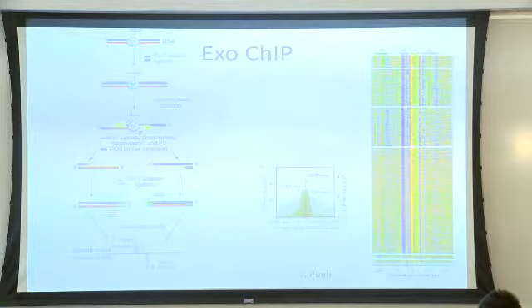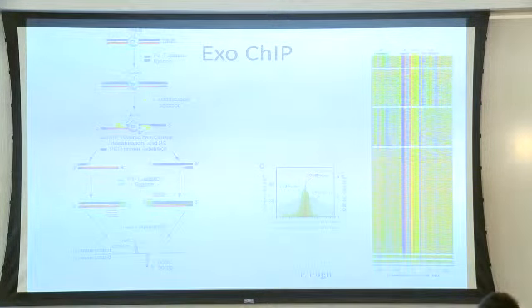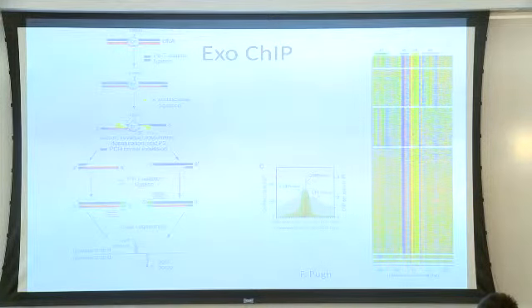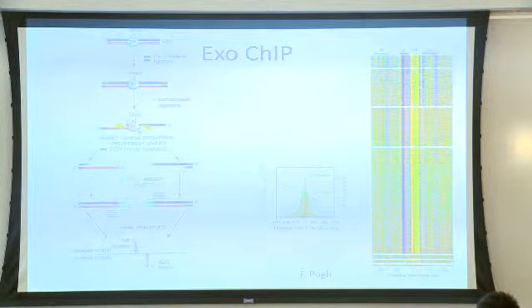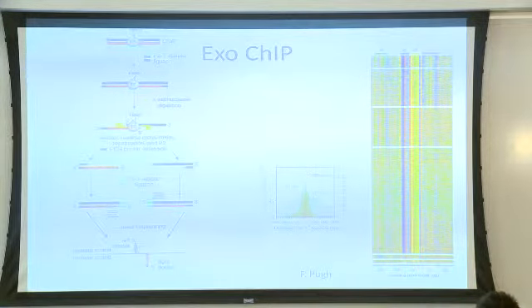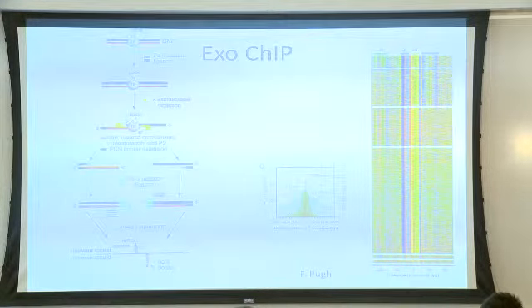And then in this cluster analysis, a few different binding motifs are defined, which are similar to each other, but they're not identical. So there's 1, 2, 3, 4 principal binding motifs for this factor. And this experiment is actually done in mammalian cells. The earlier work that Frank Pugh and his colleagues did was in yeast, but they've actually demonstrated that this method can be made to work in mammalian cells as well.